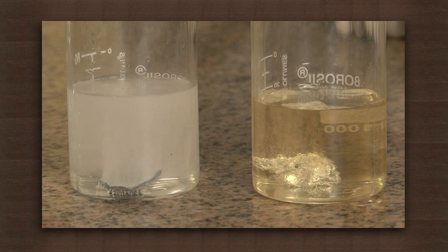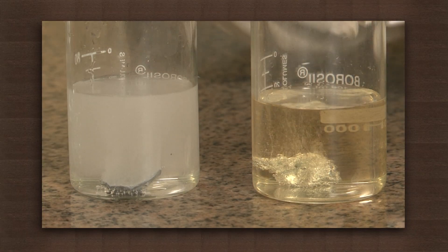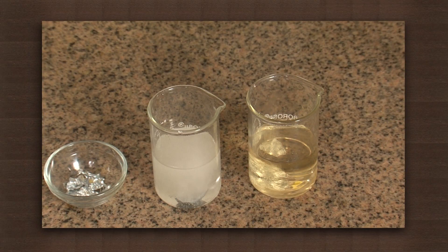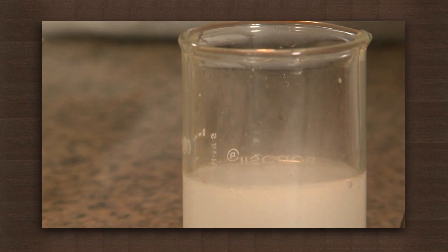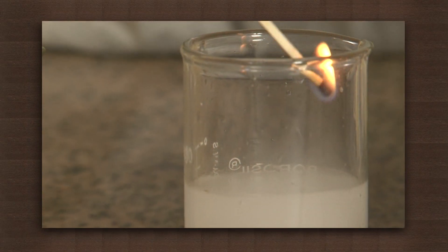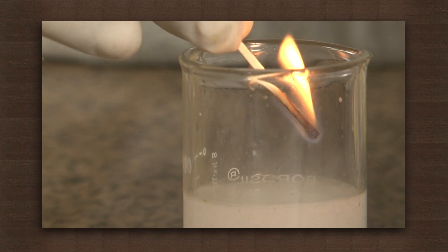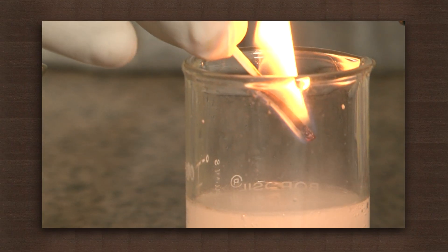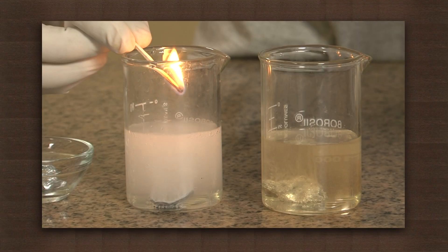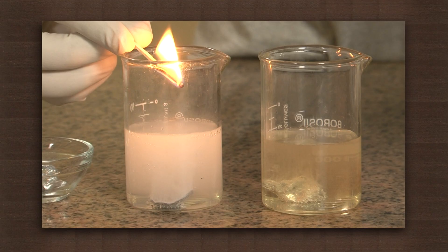Take the beaker containing dilute hydrochloric acid, light a matchstick and introduce it into the gas near the mouth of the beaker. You will see that the matchstick burns with a pop sound when brought near the open end of the beaker.